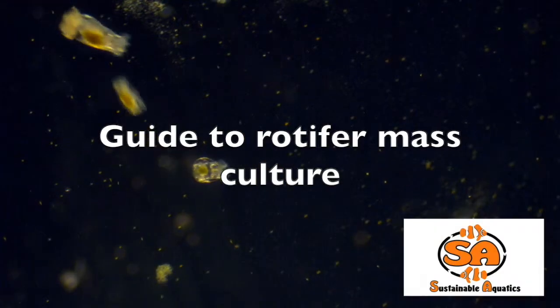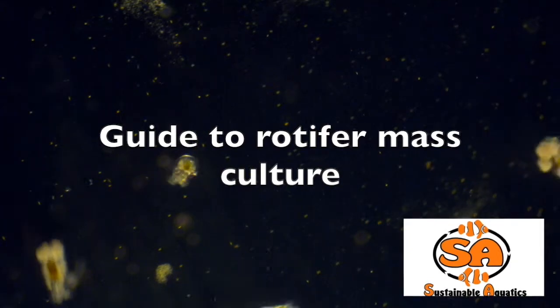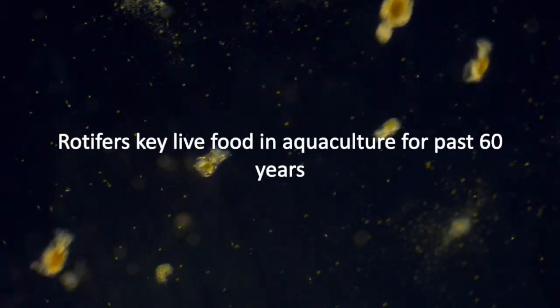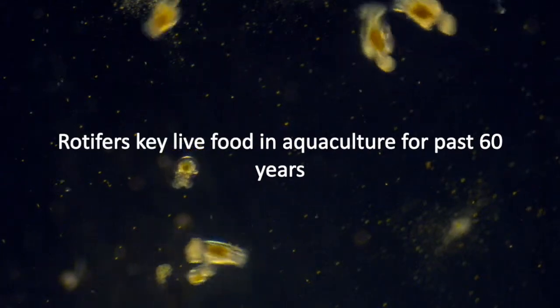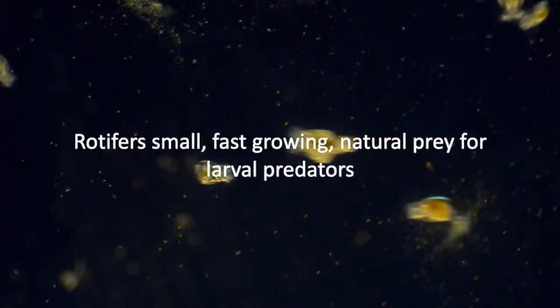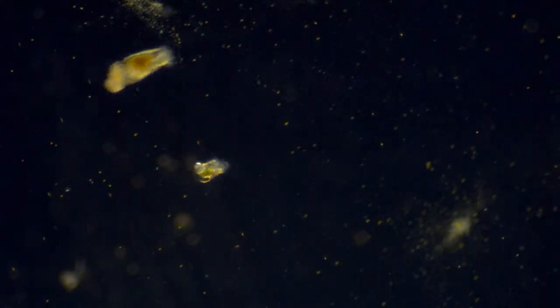This video provides instructions for how to mass culture rotifers in the genus Brachionus. Rotifers have been a key live food in aquaculture for the past 60 years. Rotifers are small, fast growing, and natural prey for many larval predators.